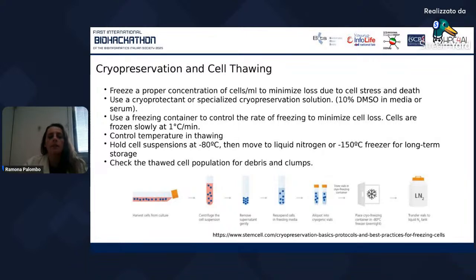And I can use also cryopreservation solution like 10% of dimethyl sulfoxide in media or serum to reduce the disruption of cells.